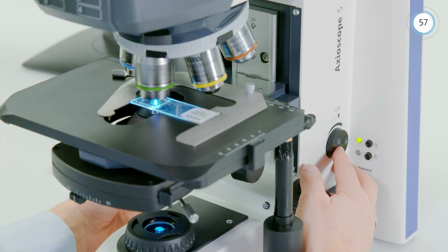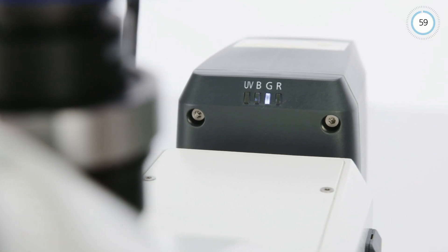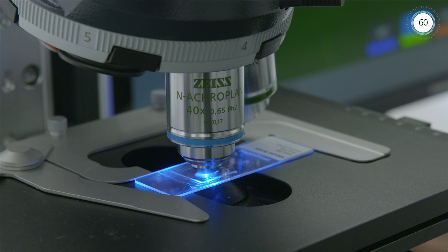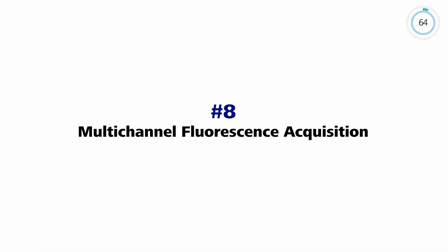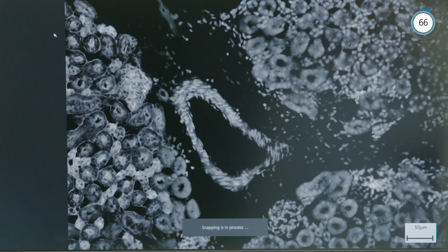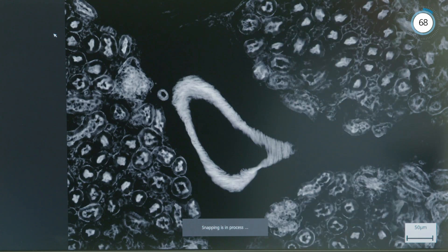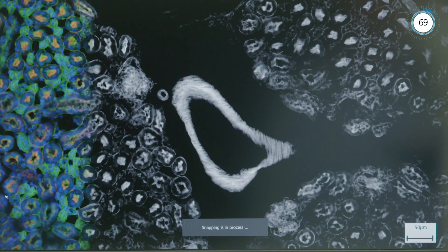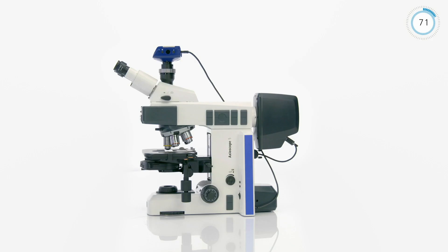Opt for the maintenance-free fluorescence LED illumination Colibri 3 and toggle between different colors with ease. With Axioscope 5 and Colibri 3, you can capture up to four fluorescence channels with just one click.